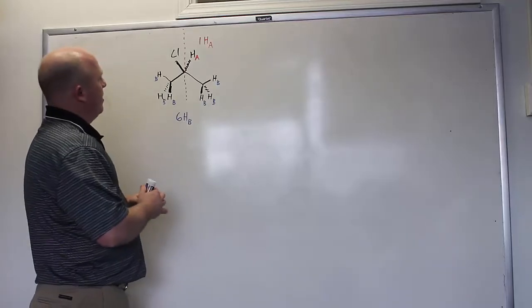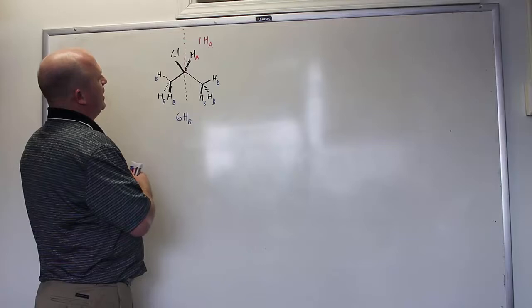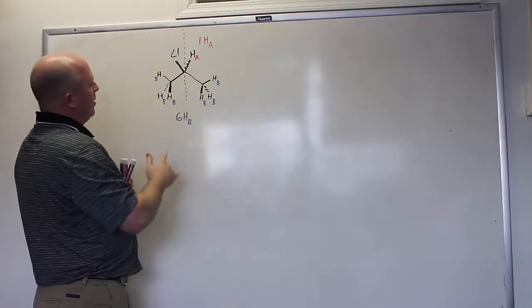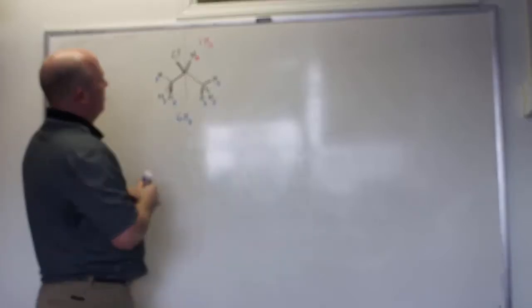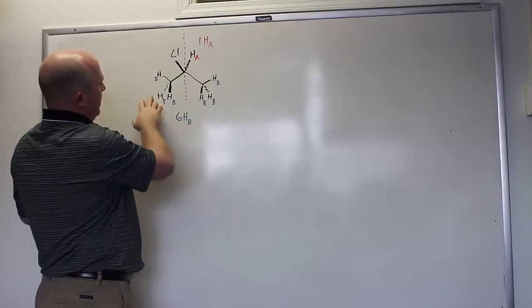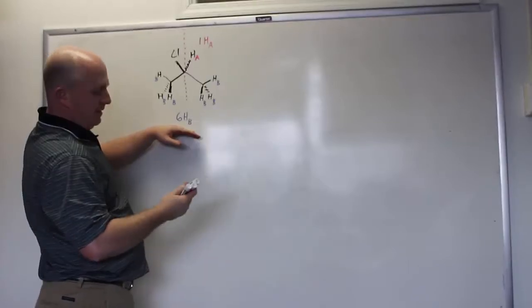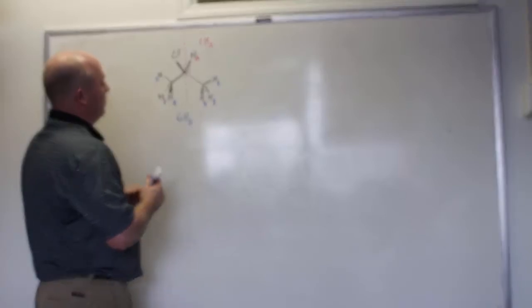Here we're going to talk about multiplicity. Looking at the molecule isopropyl chloride, what we see is a single hydrogen in the environment that's bound next to the chlorine. We also see 6 hydrogens in the environments that are bound out at the end, away from the chlorine, on the methyls. Because there's a plane of symmetry running straight down the molecule, these signals all end up in the same place, and so you get 6 hydrogens in environment B, a single signal for environment B.